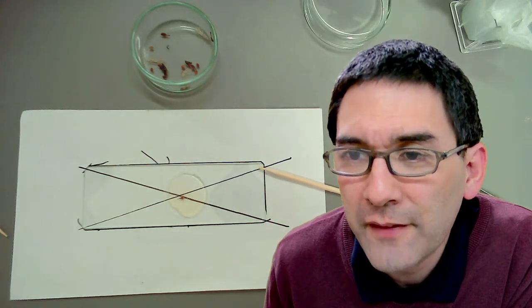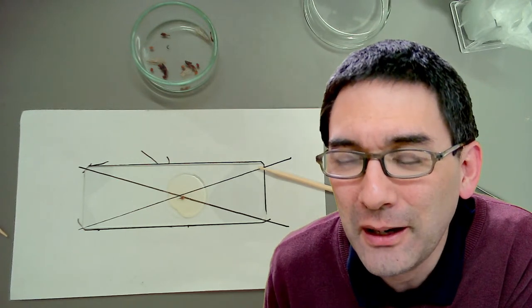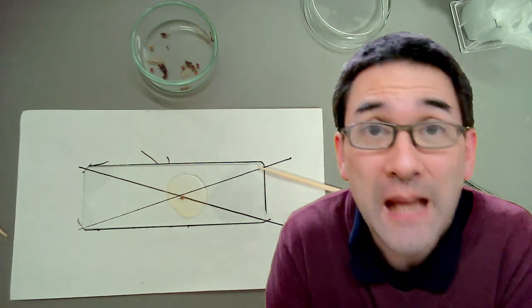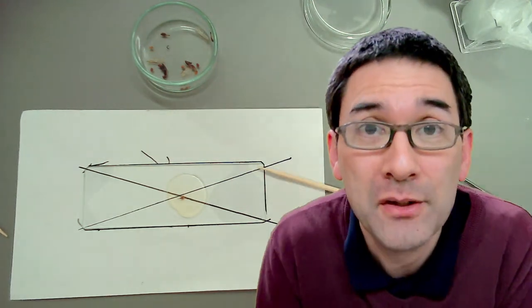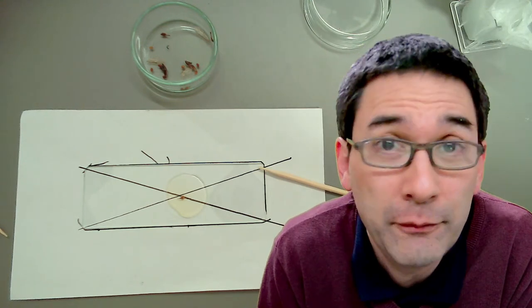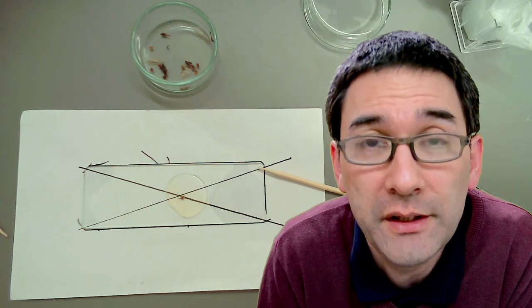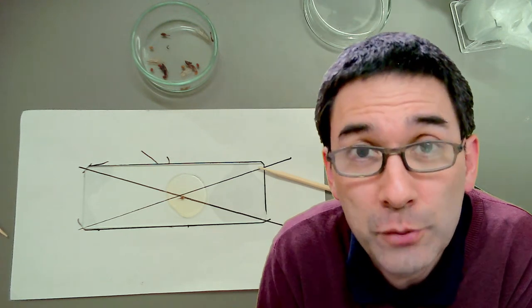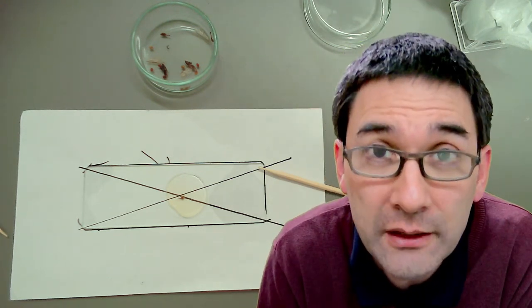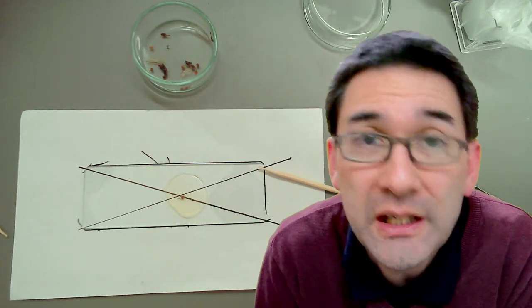My microscope arrives on Wednesday and I would cry if I got my objective in the media. Okay, well, honestly, things like this happen, and will happen to me sooner or later. If this happens, you have to clean it. You basically take alcohol, a solvent, on a tissue paper, and then you carefully clean your objective. Just make sure that no alcohol actually flows into the objective.